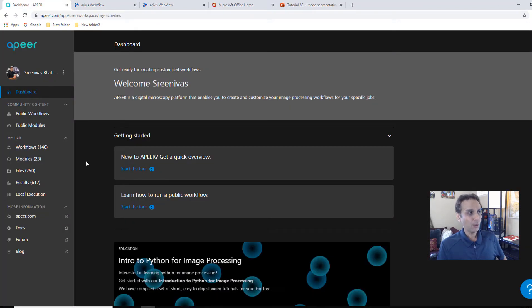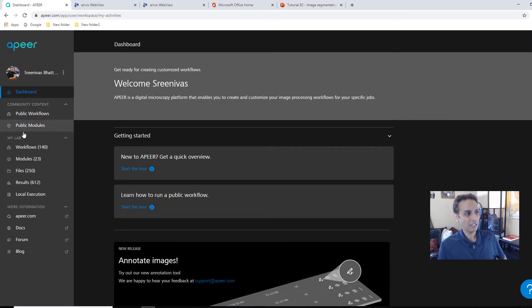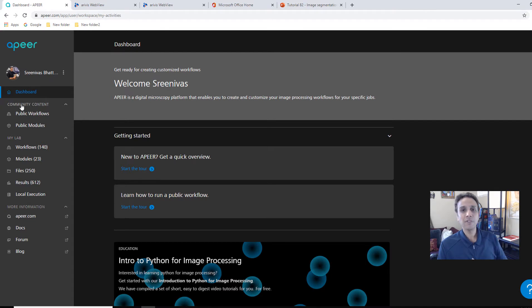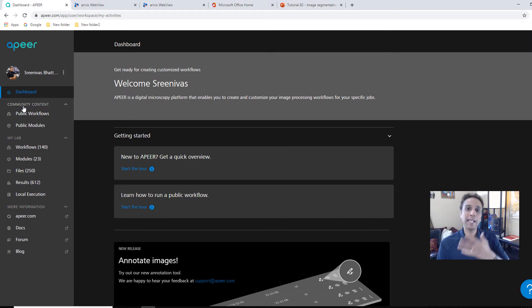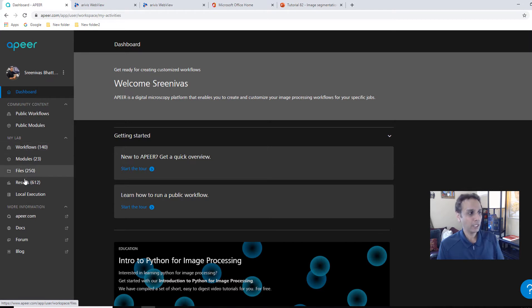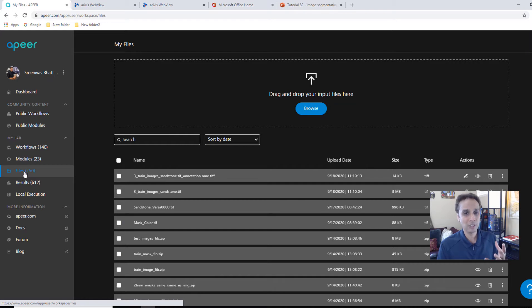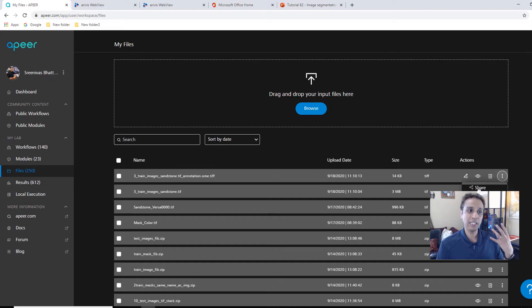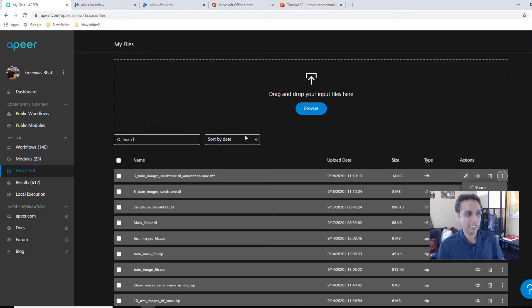Now on the left hand side, you will see a few areas here. First one says community content. The next one says my lab. The community content is visible to everyone. Anyone can see community content. So this is like your public app store. My lab, no one can see it. It's only you can see it. You can upload your files. You can upload up to 100 GB of free file storage. So please use it.